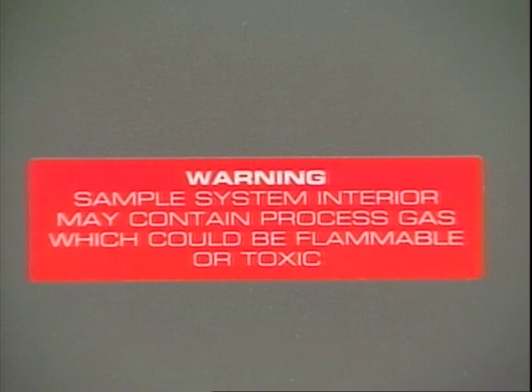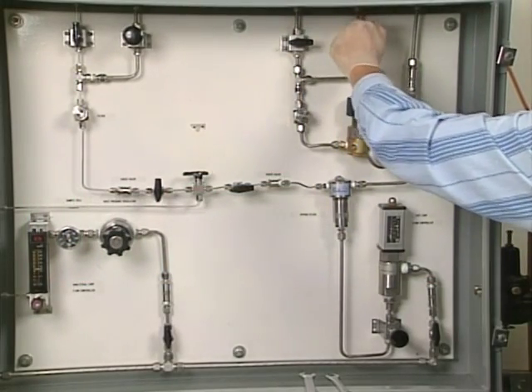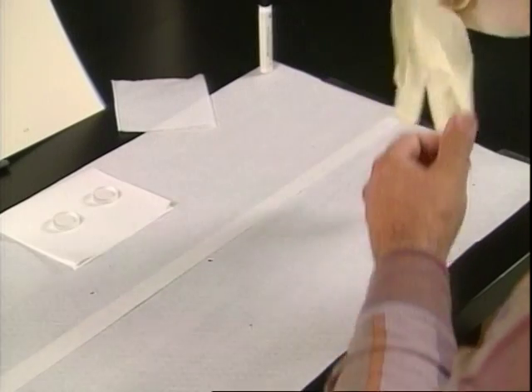Keep in mind that many process samples, gas and liquid streams, and test samples are toxic. They may also be asphyxiates, corrosive, flammable, or a combination of these. The analyzer should be vented according to your facility's guidelines and manufacturer's recommendations. All sample pressure indicators should be checked before any tests or maintenance to ensure that there are no leaks and that the sample cell is free of gas and process sample.